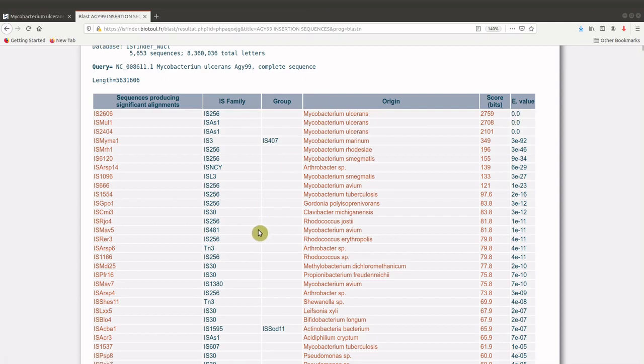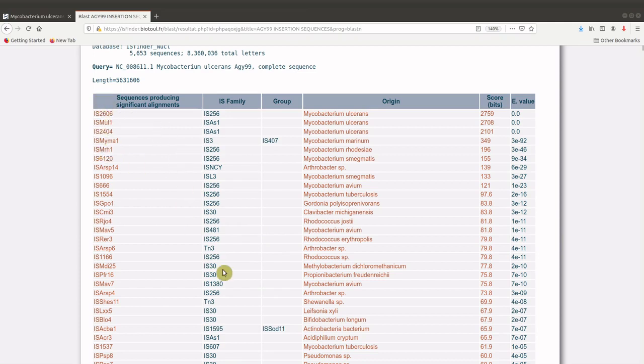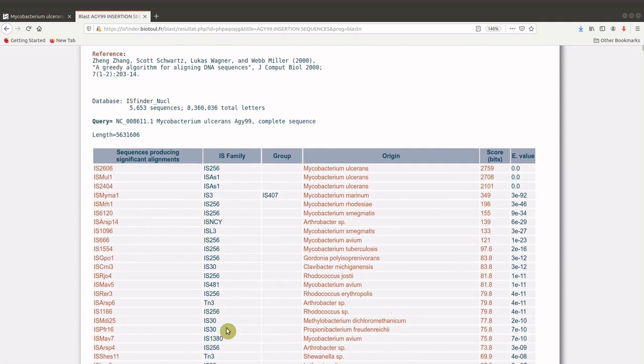You should also note that this is a qualitative search, meaning that it gives you the insertion sequences that are present, but it does not reveal to you how many there are in that sequence. And so to find out how many of each of these insertion sequences there are, then you can use genome annotation tools like RAST.